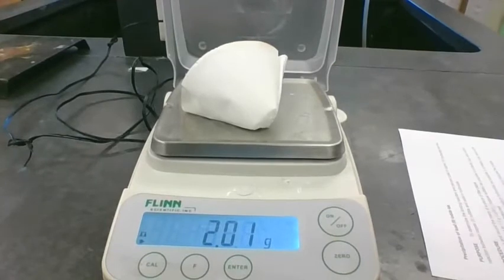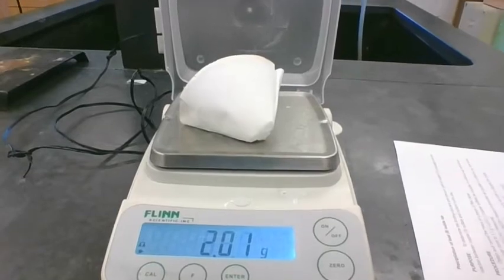Looks like we got 2.01 grams for our mass of filter paper and Cu(OH)2. Then we subtract the filter paper, which was 1.42 grams. So we subtract those, and I get 0.59 grams for my actual yield.